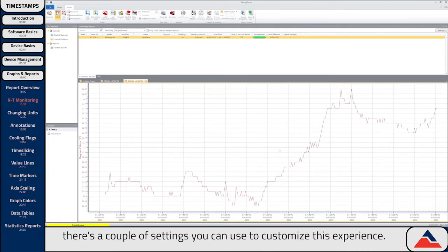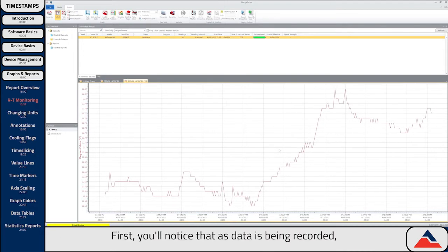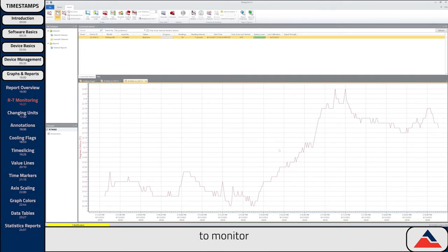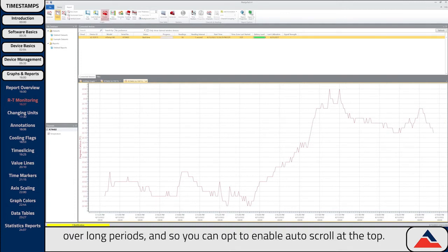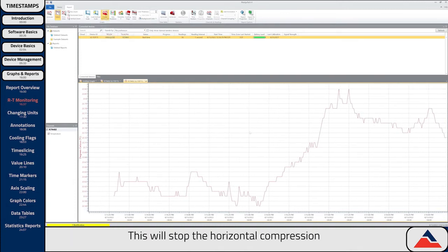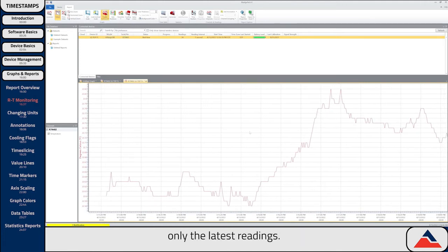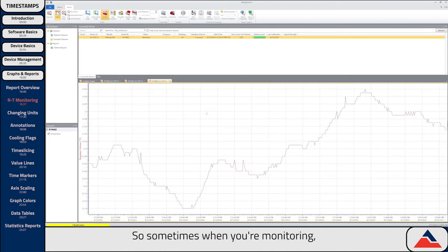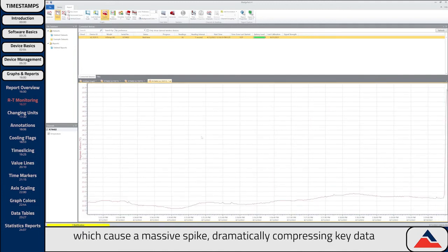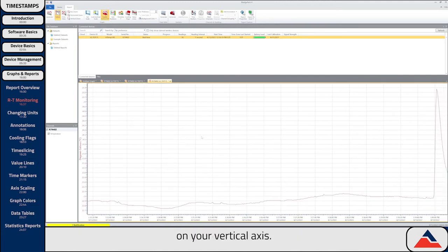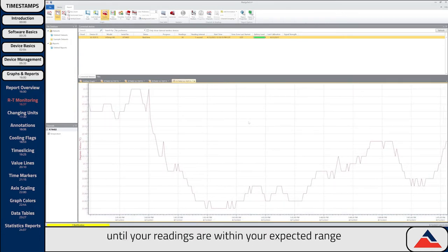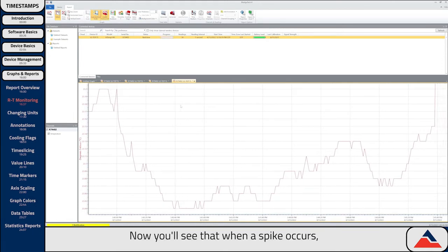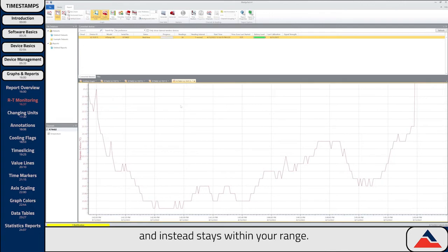Real-time monitoring is when you reference your graph as data is being actively recorded via the real-time start. There are a couple settings you can use to customize this experience. First, as data is being recorded, the default is for the graph to constantly compress its horizontal axis. This can make data difficult to monitor over long periods, so you can opt to enable auto-scroll at the top. This will stop the horizontal compression and instead side-scroll the graph, updating it with only the latest readings. The next tip is the vertical axis lock. Sometimes when you're monitoring, you'll have incidents which cause a massive spike, dramatically compressing key data on your vertical axis. If you'd like to avoid this, wait until your readings are within your expected range, and then select Lock Vertical Scale in the reports menu bar. Now when a spike occurs, the vertical scale does not compress and instead stays within your range.